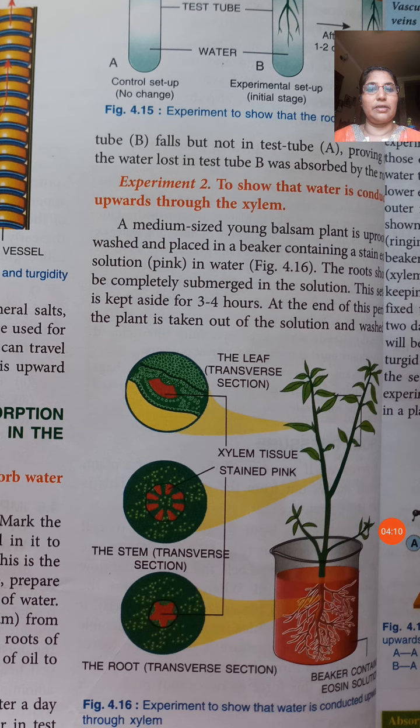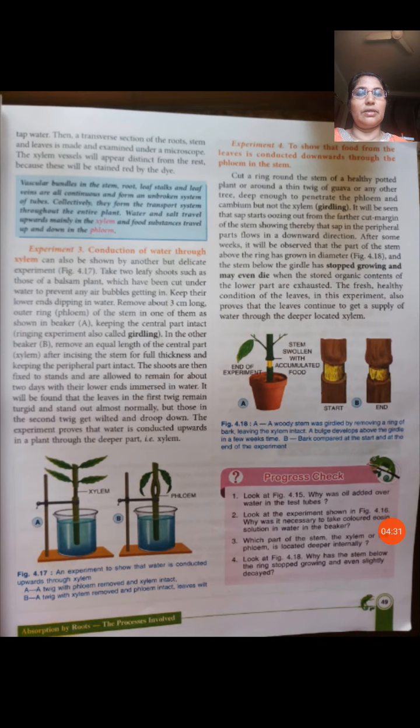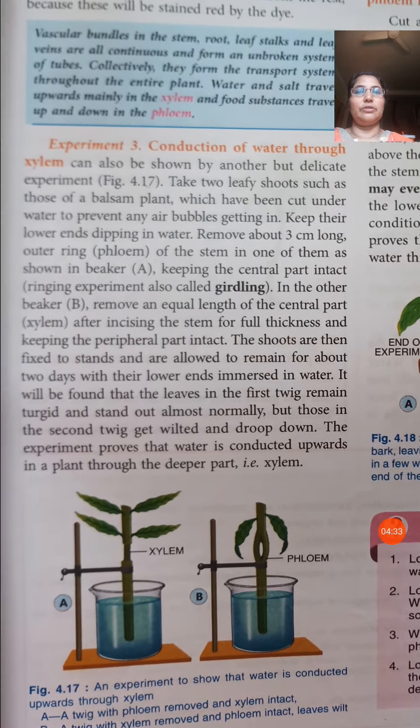If we cut a transverse section and observe it through the microscope, we can see the xylem vessel more clearly. So the experiment is proving that the water is conducted upward only through the xylem vessels. Then again, you see another experiment.